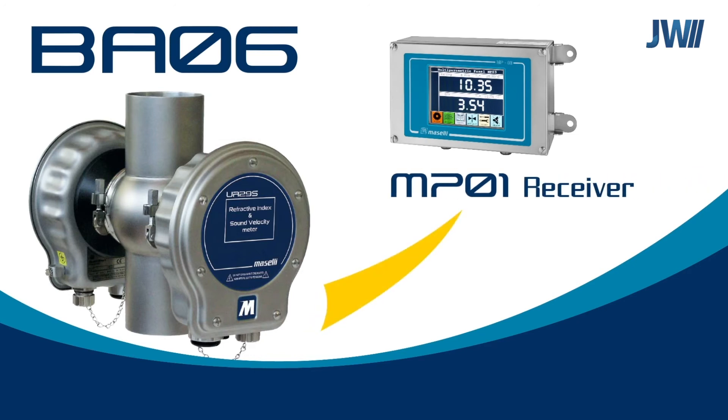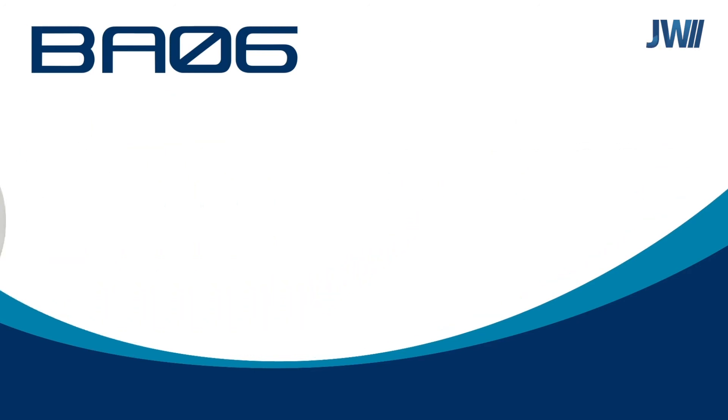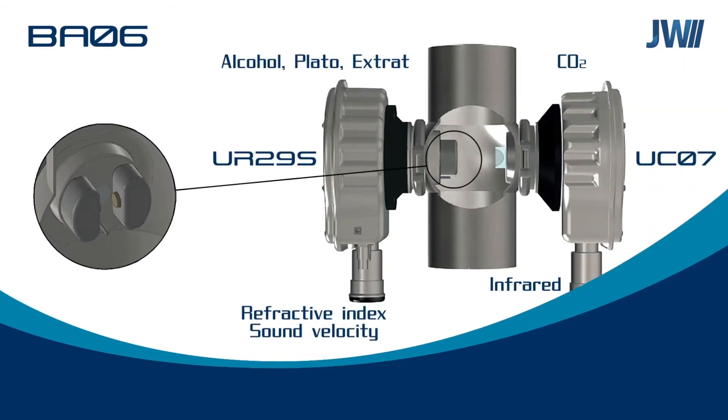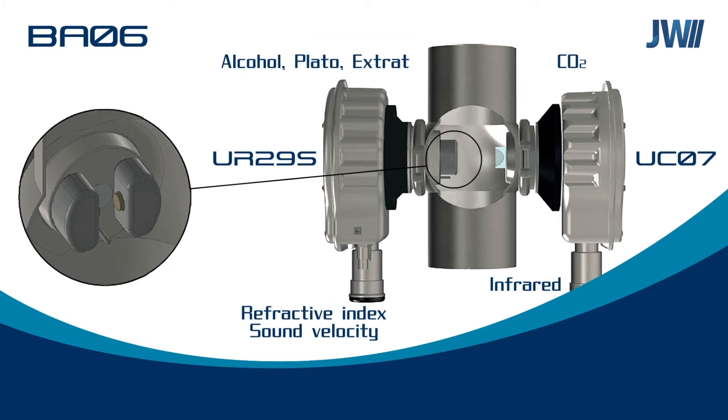All Maselli systems can be connected to a touchscreen operator panel. We show here how the Maselli sensors connect into the production line in a modular way. No pumps are required, as our systems are 100% inline.